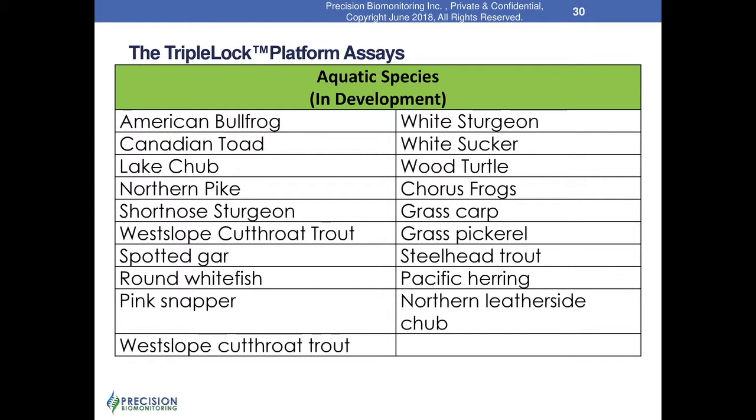In those cases as well, where we have multiple assemblages of potential target species, we also optimize our multiplexing. Multiplexing is performing PCR reactions on multiple species in the same reaction tube. So that information is vital. But essentially, yes, we do require, in the first instance or in pilot studies, known occupancy by the target in some locations.